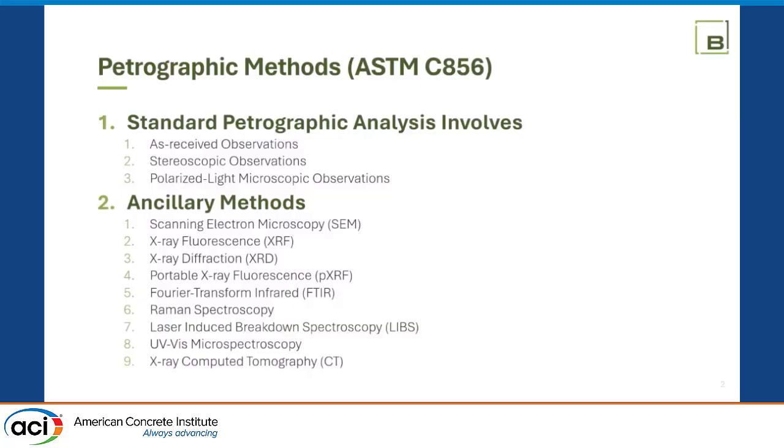Portable X-ray fluorescence is also very helpful to better understand what's going on. I've been playing with that. It's literally a ray gun. Don't point it at anybody. It will cause some harm. But you can get answers in about 60 seconds, especially if it's attached with a LEAP filter, a light element analysis protocol filter.